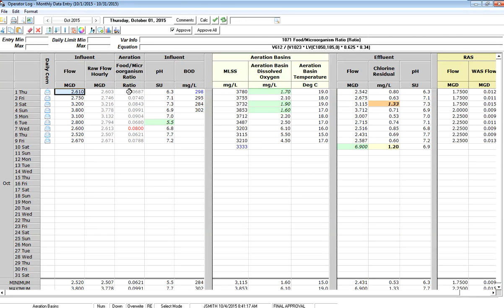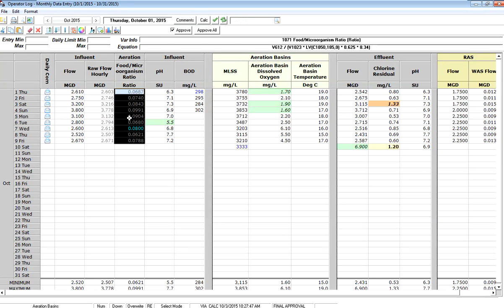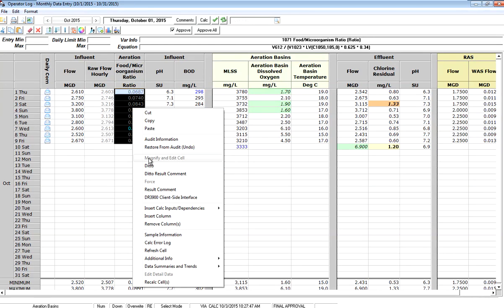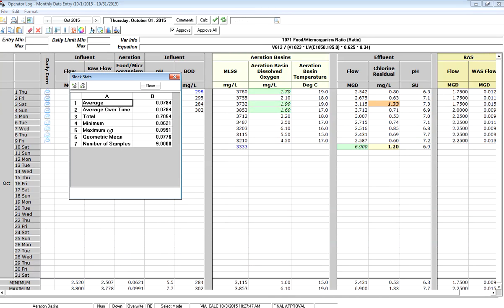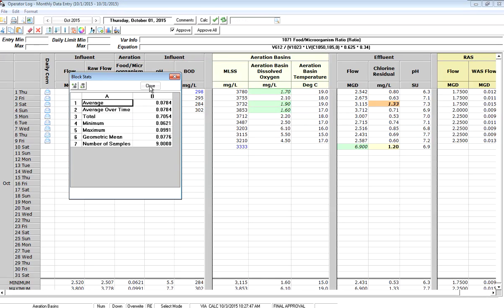There's my data. The boss says let me see what is it month to date. What I can do is I can right-click on the block of cells that I've highlighted and go to data summaries and get block stats. This will show me the average and the min and the max for the cells that I have highlighted.